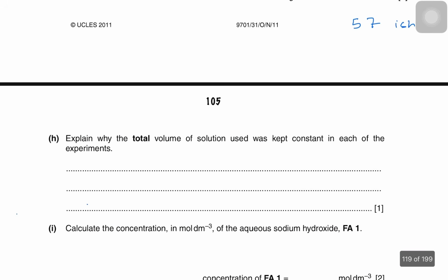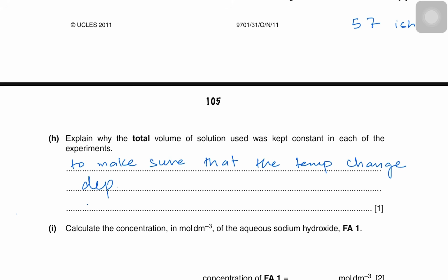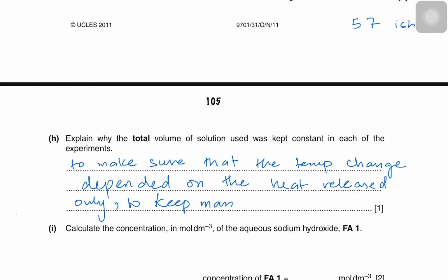So you can say, to make sure that the temperature change depended on the heat released only, to keep the mass of solution constant.